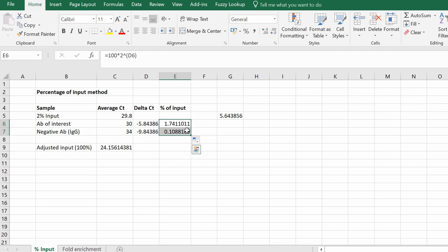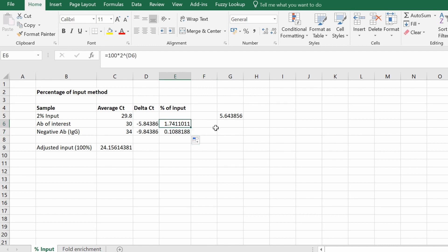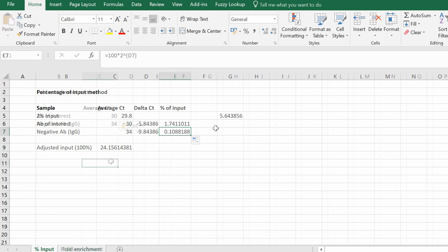These values represent the percentage of input for our samples. The antibody of interest has a percentage of input of 1.74% and the negative antibody sample has a percentage of 0.10%. That's how you do the percentage of input method.